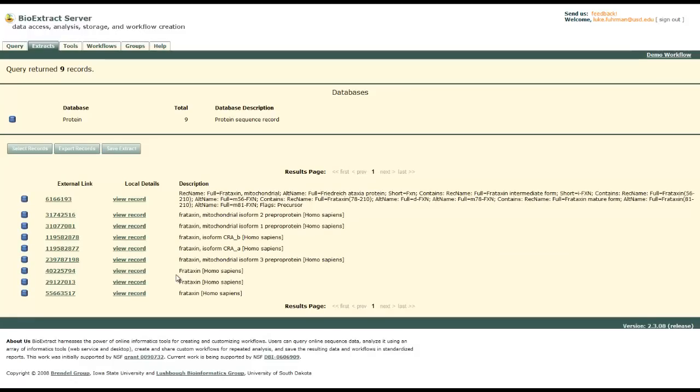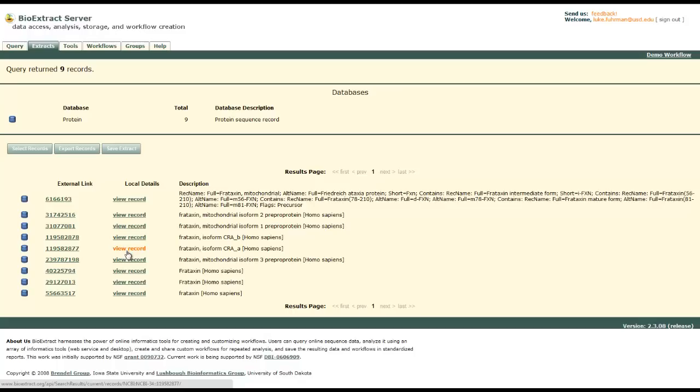So here's our query. We're going to pick a couple of these and narrow it down. You could view the record and have all the details about the gene, similar to EBI, NCBI, Ensembl.